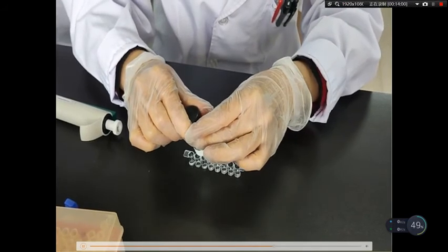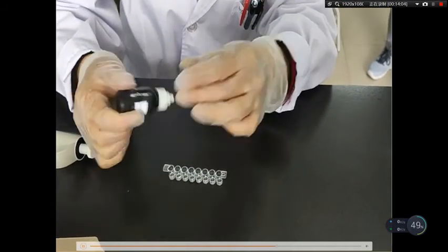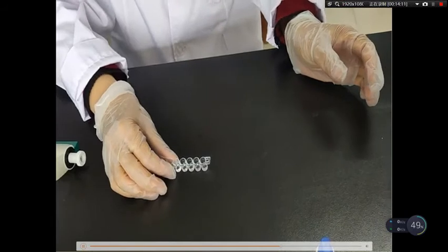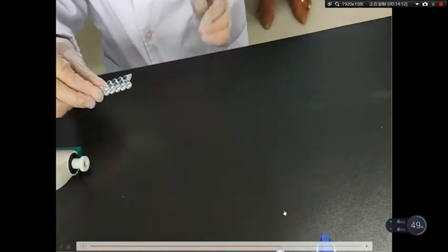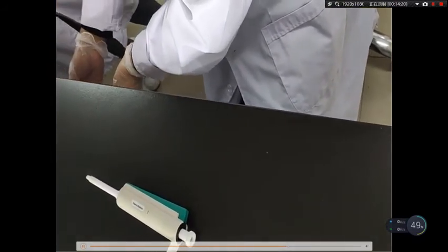Okay, then we put the plate at room temperature in the dark for about 10 minutes.